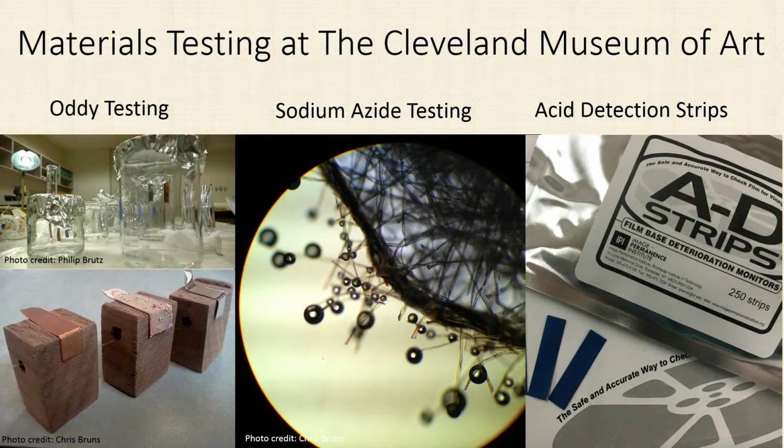That means I collect samples of all materials that any department within the museum might want to use in contact or close proximity to artwork. Typically, this includes materials for display like showcase construction materials and fabric for covering display blocks and showcase decks. It also often includes materials for storage or conservation of art objects.